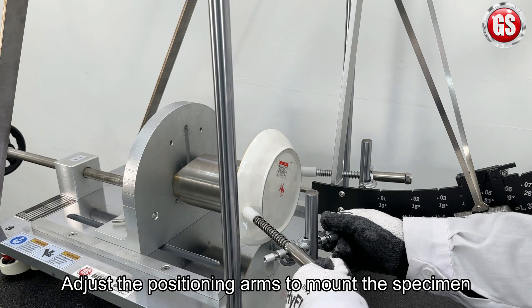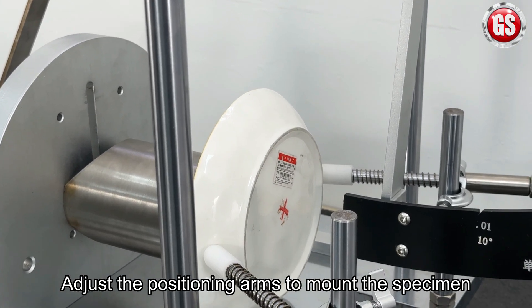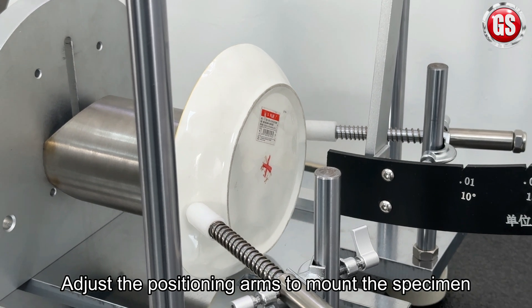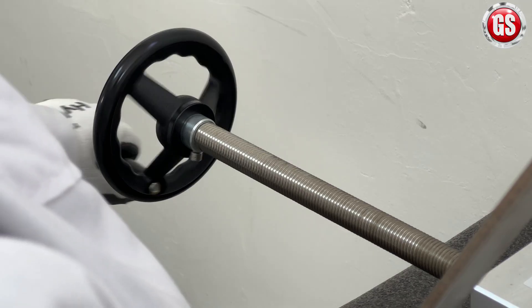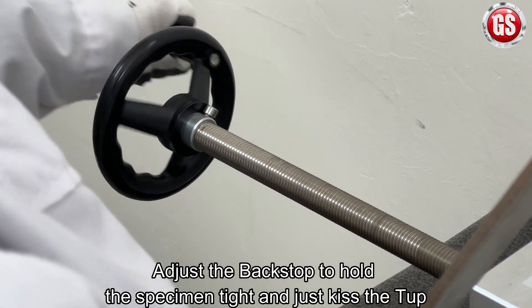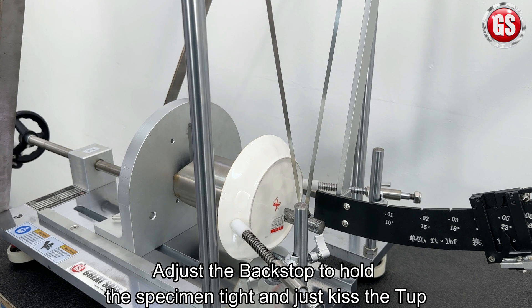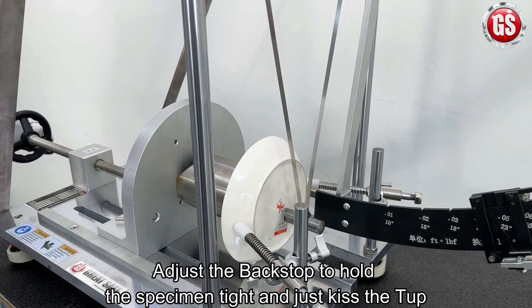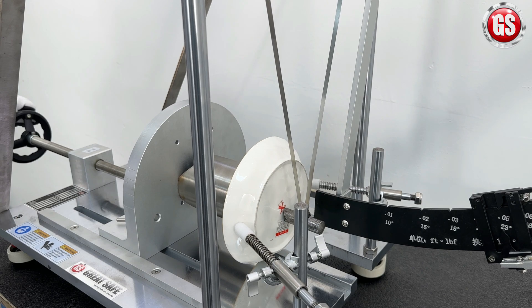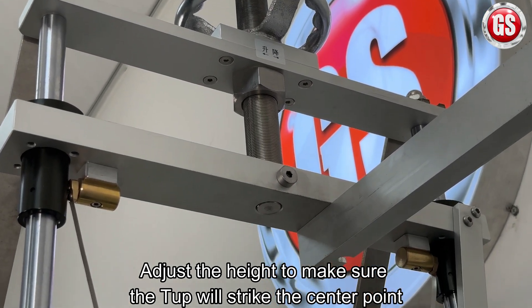First, adjust the positioning arms to mount the specimen. Then adjust the backstop to hold the specimen tight and just kiss the top. Adjust the height to make sure the top will strike the center point.